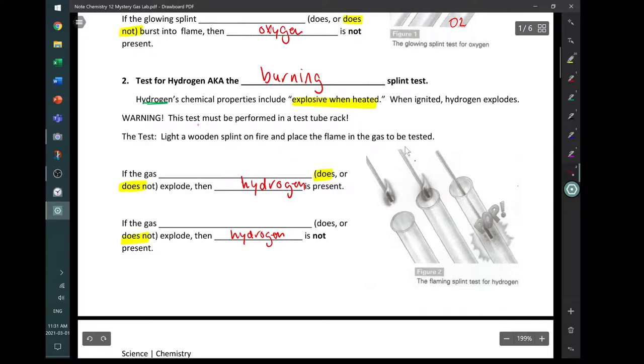And certainly a warning here, the test must be performed in a test tube rack because the explosion can be a little scary sometimes. If we're not careful, we drop our test tube. And of course our test tube is going to have chemicals in it. They could be hot, they could be on fire. We don't want to drop them on our toes. So our test is to light a wooden splint on fire. We're going to place that fireball in the gas to be tested. If the gas does explode, then hydrogen is present. If the gas does not explode, then hydrogen is not present.